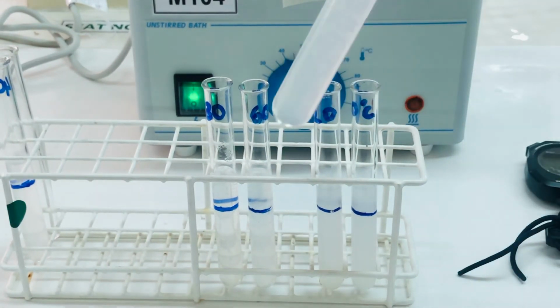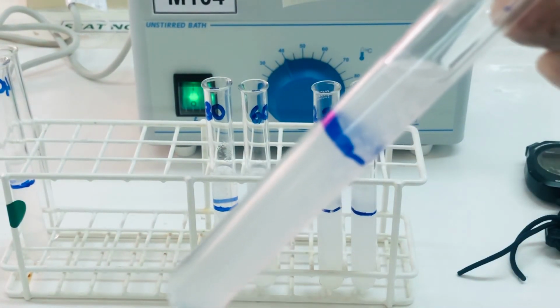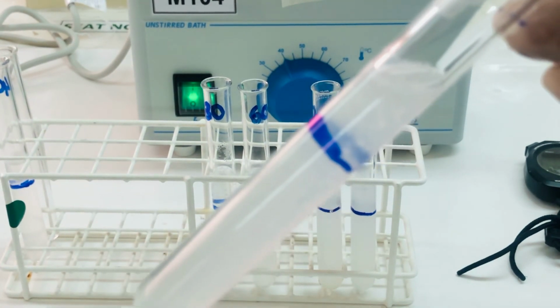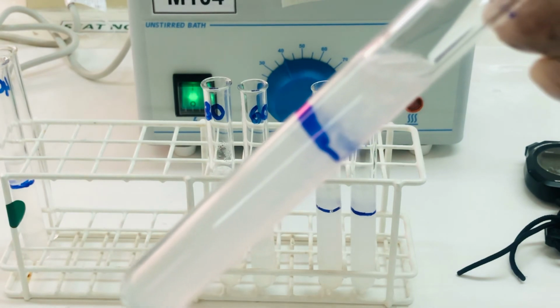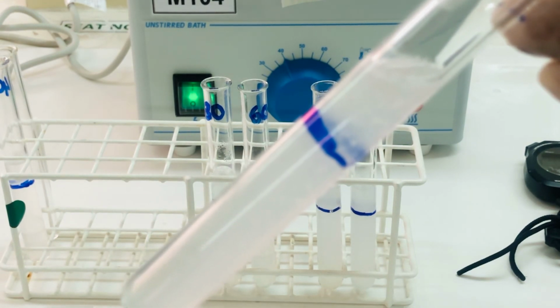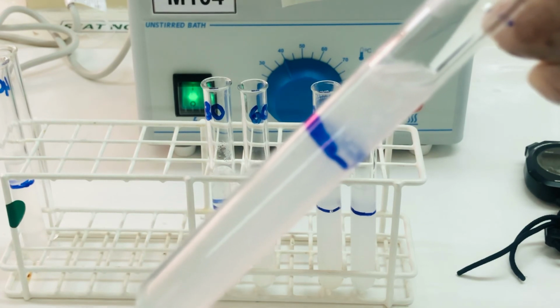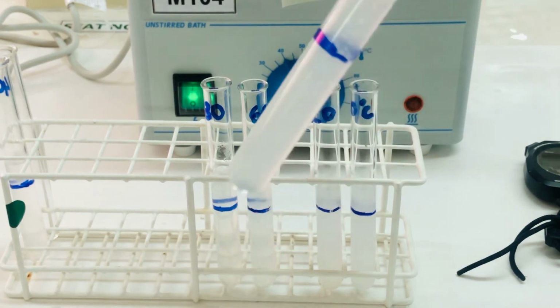As for 40°, you can easily see a lot of curdling has taken place, and in fact the time taken was least at the 40°. When the curdling process started, the time recorded was the smallest.